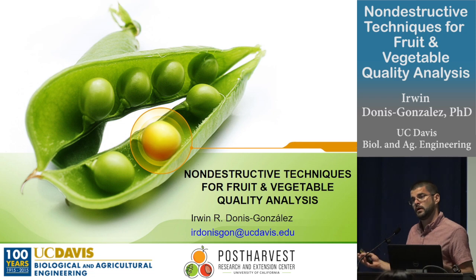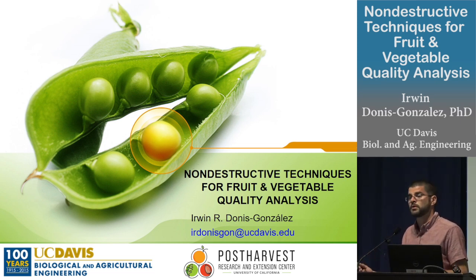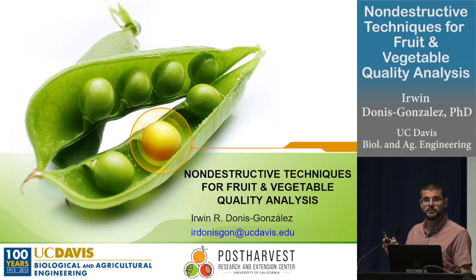And the purpose of this talk is not to exhaustively describe every single technique, but for you guys to be a little bit aware of what's real and what's fake, or what are the type of questions that we need to ask. There's so many equipment manufacturers out there, and there's so many promises of things that supposedly a piece of equipment does, but I believe that after this talk, you can ask the right questions of seeing if that's real. So we'll talk about non-destructive techniques today.